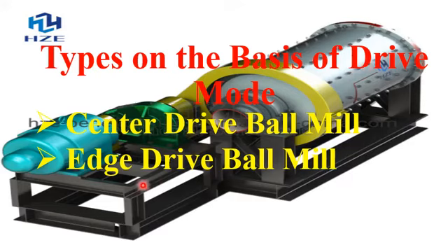So the second type of drive mode ball mill apparatus, as I discussed, is the edge drive ball mill apparatus. In the edge drive ball mill apparatus, the motor drives the gear at the edge of the cylinder through the reducer, and that basically results in a conversion of bulk material into an ore or a fine material.